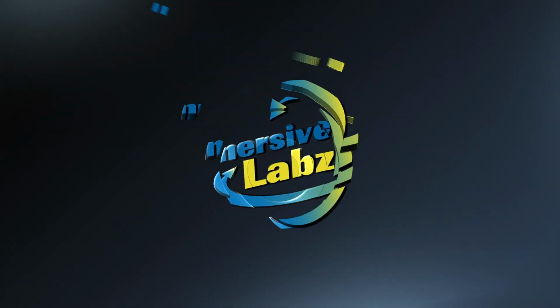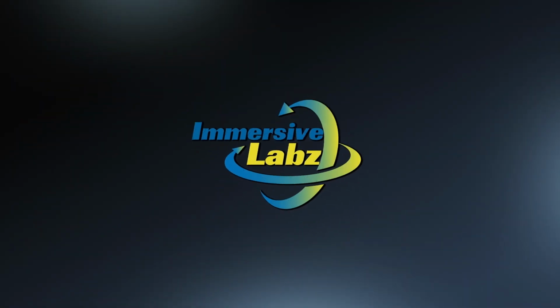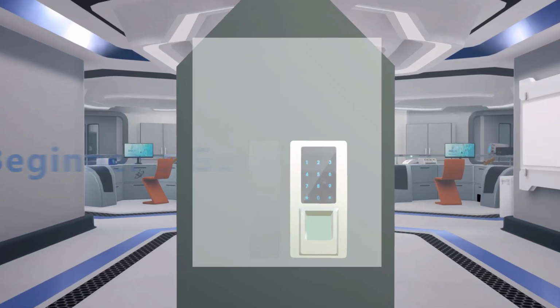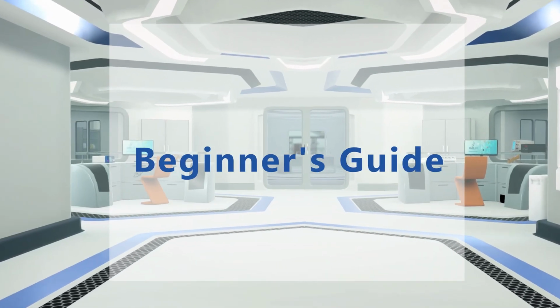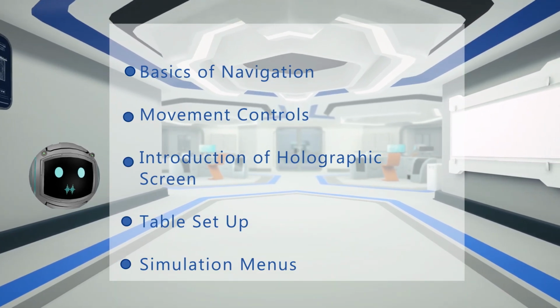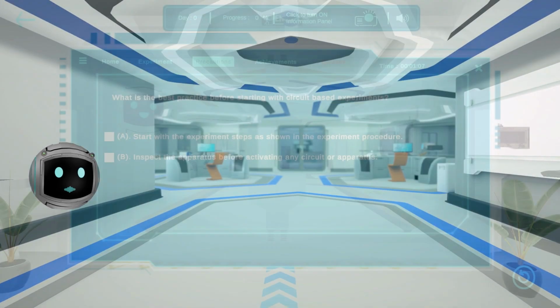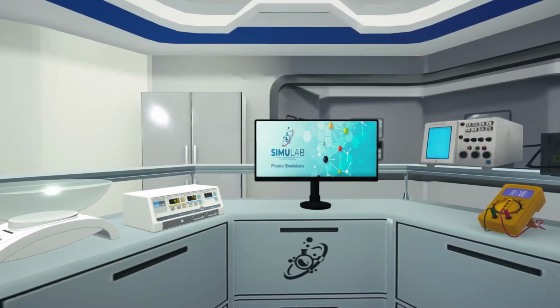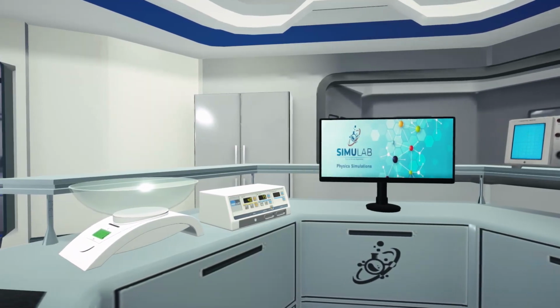Welcome to SimuLab, your virtual science laboratory for simulating true-to-life lab experience. Let's comprehend how you can navigate within the SimuLab, controls used for the movement, what is the holographic screen, how your table setup looks, and what are the different menus available during the simulations.